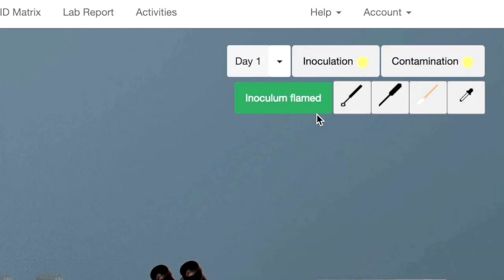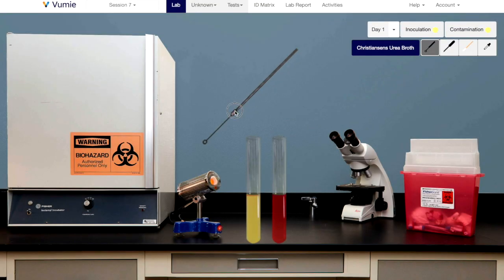Select the transfer tool. If it's a loop or a wire, flame it. Then move the tip of the transfer tool down into the inoculum broth. A message will appear indicating success.